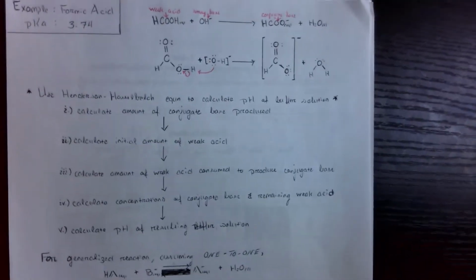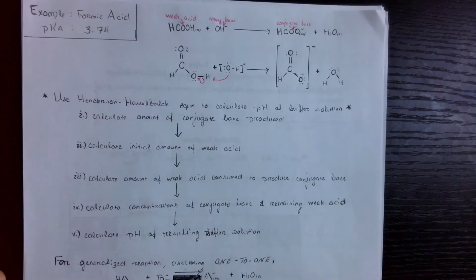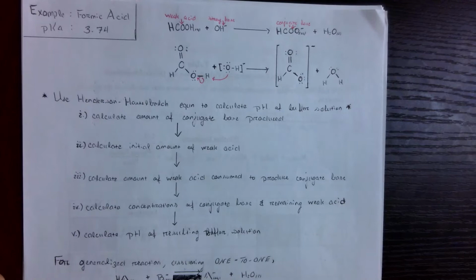Okay, this is the first of a set of two walkthrough videos that I put together to discuss the buffer solution labs. So there are two. In a standard semester, you would have done two buffer solution labs back to back, so one followed by the other. And in each lab, you would prepare a series of 3 buffer solutions.